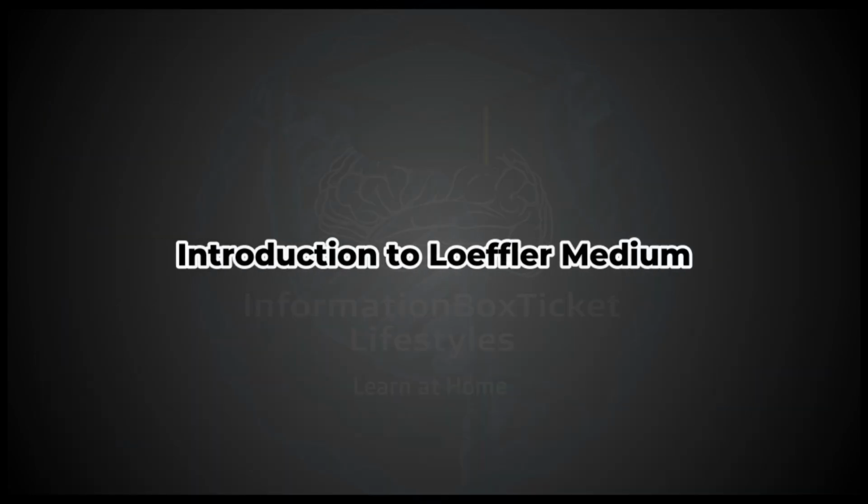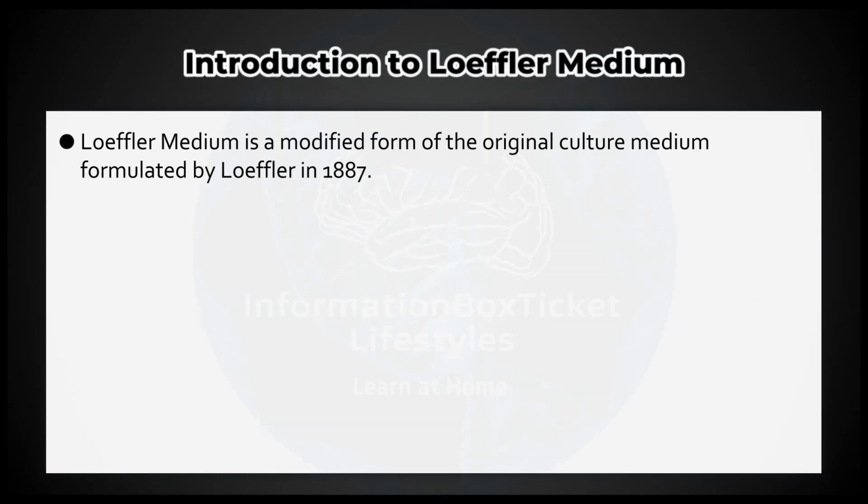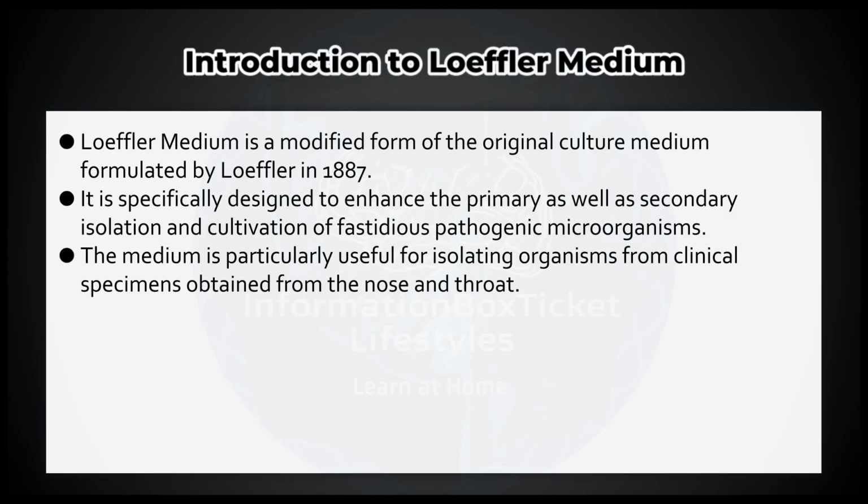Introduction to Loeffler Medium. Loeffler Medium is a modified form of the original culture medium formulated by Loeffler in 1887. It is specifically designed to enhance the primary as well as secondary isolation and cultivation of fastidious pathogenic microorganisms. The medium is particularly useful for isolating organisms from clinical specimens obtained from the nose and throat.